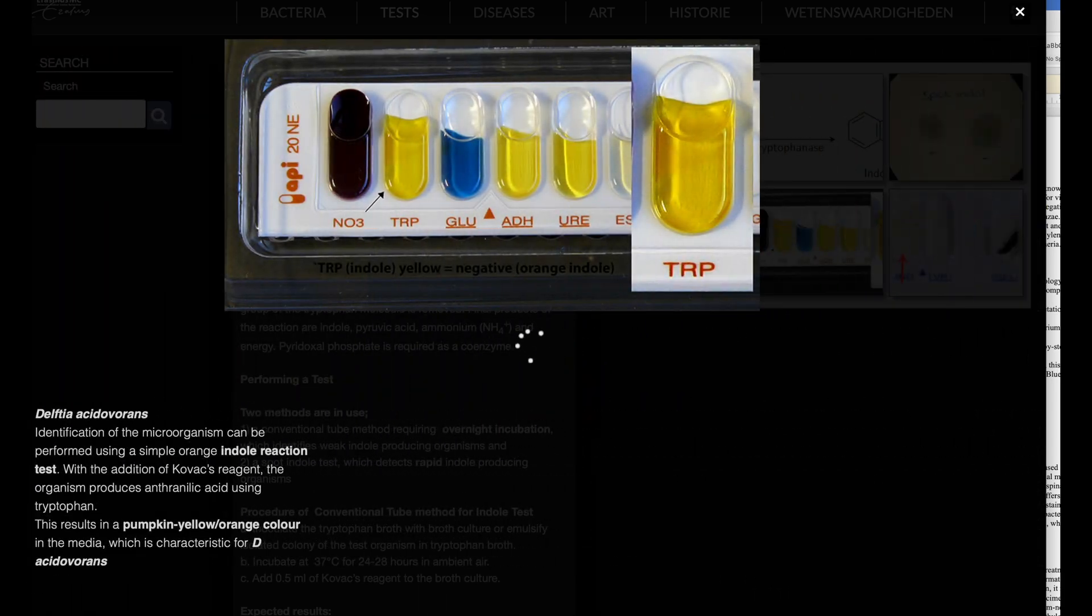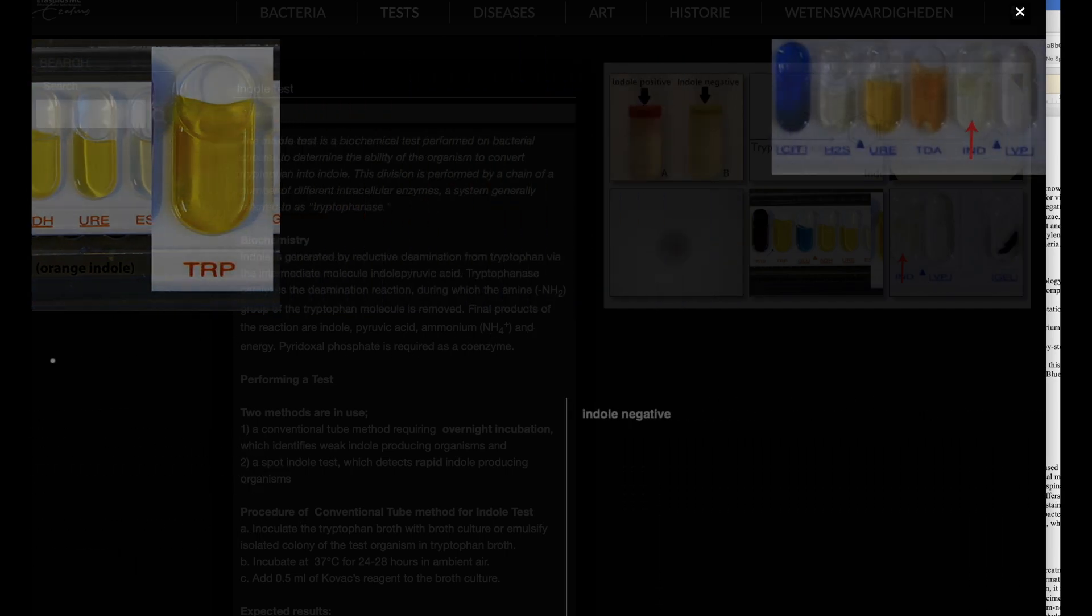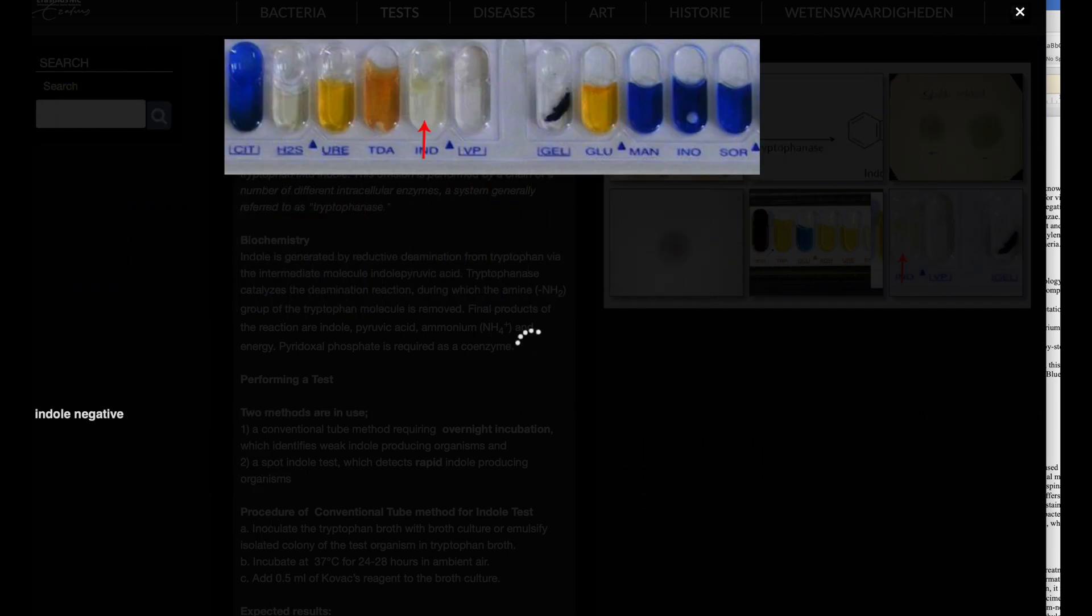Results of spot indole test. Positive: a blue color develops within 30 seconds. Negative: no color development or a slightly pink color.